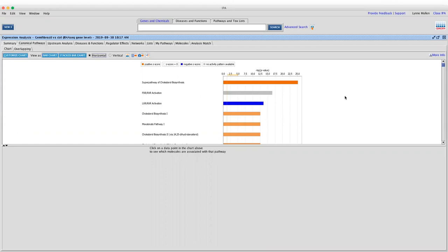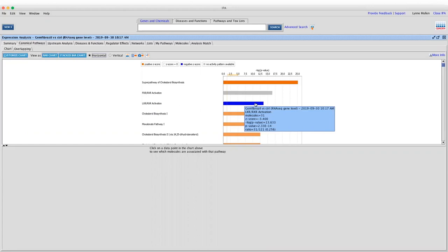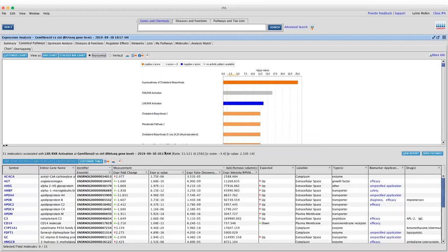Let me look at a bit more detail using the LXR-RXR activation pathway as an example. It has a z-score of −3.4 and a great p-value. Here we can see the 31 molecules in the analyzed data set that are part of this pathway — their symbols, the identifiers I uploaded, the data measurement values, and an Expected column showing how each gene or protein is expected to behave if that pathway were activated. We also have information about the location, type, and drugs known to target each molecule.